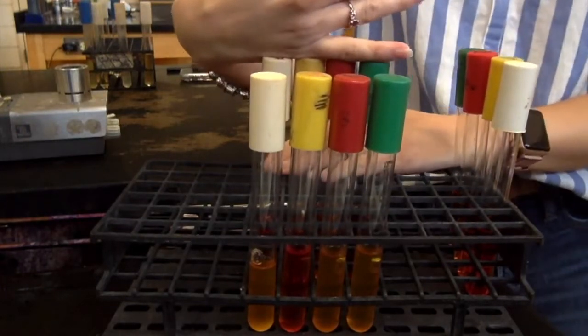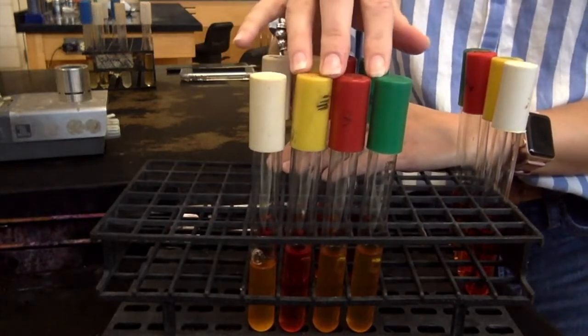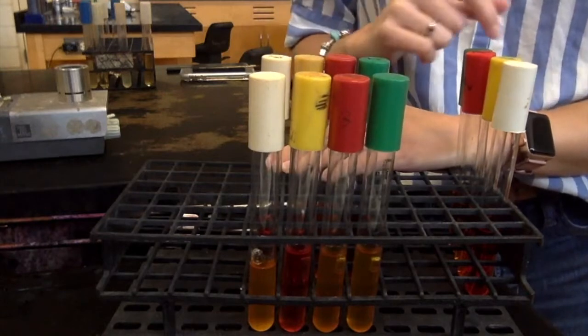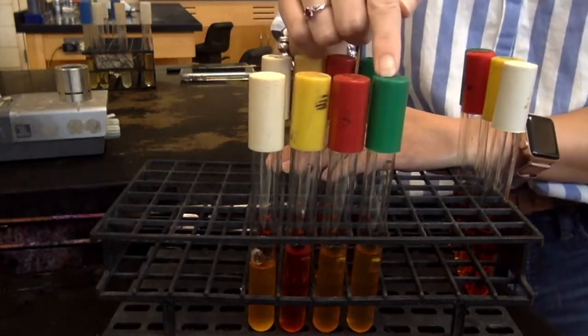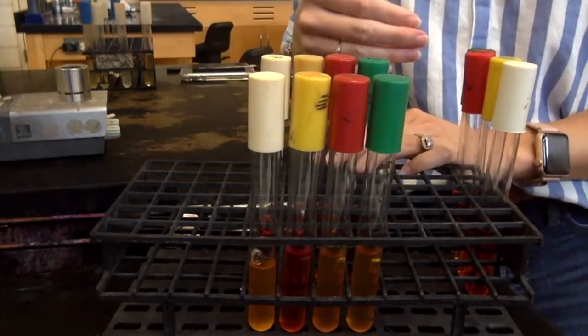Okay, so for phenol red, under acidic conditions, phenol red turns yellow. So when the sugar is fermented, acids are produced, pH drops, phenol red turns yellow. Now, don't get that confused with the methyl red.